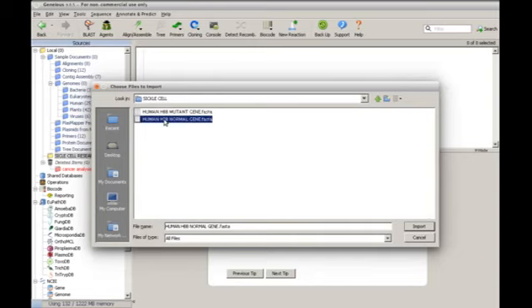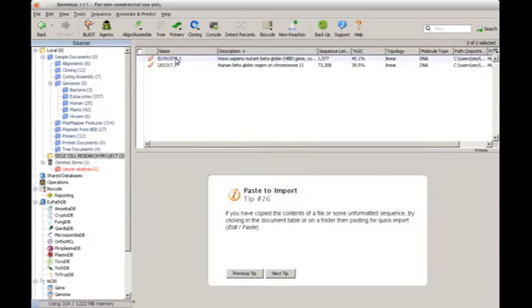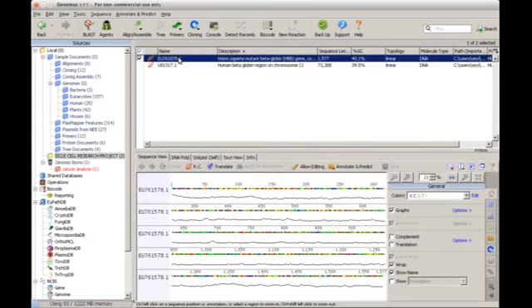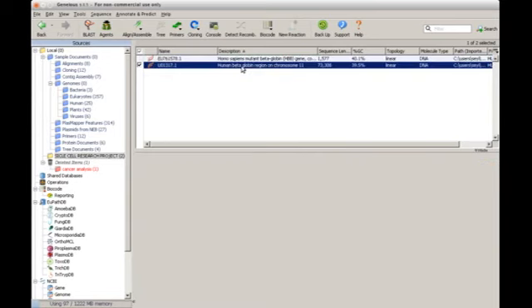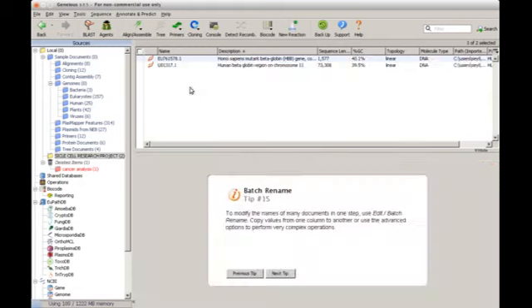So you can highlight everything here and then import everything to the Geneious software. The Geneious software will ask you if you want to keep sequences separate or create a sequence list. So keep sequences separate. So you have it here. Now this is the Homo sapiens mutant hemoglobin. This is the mutant file of the sickle cell, while this is the normal file of the sickle cell. So the next thing we do now is we work on the DNA analysis.